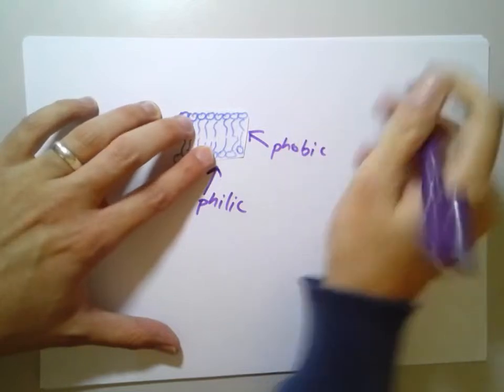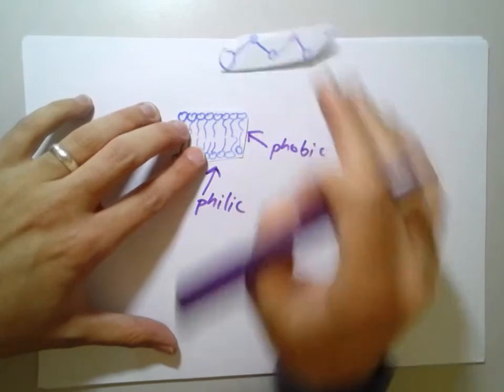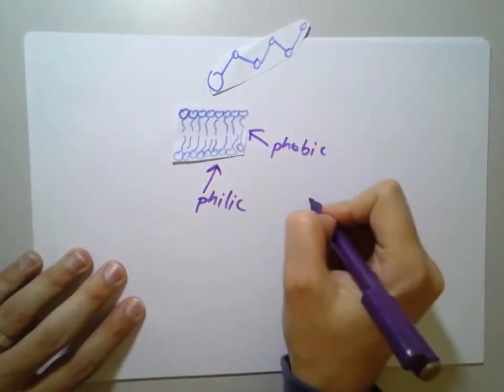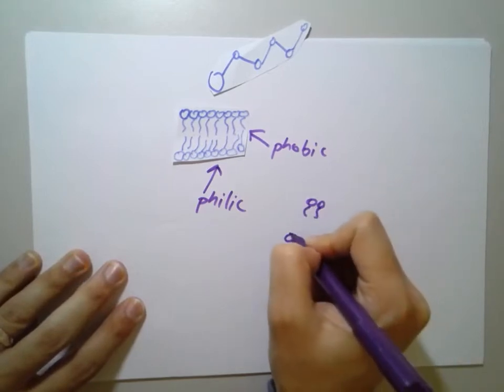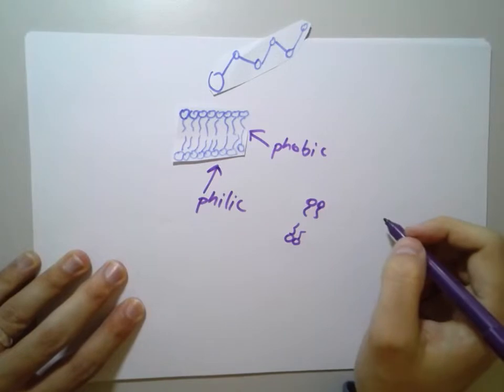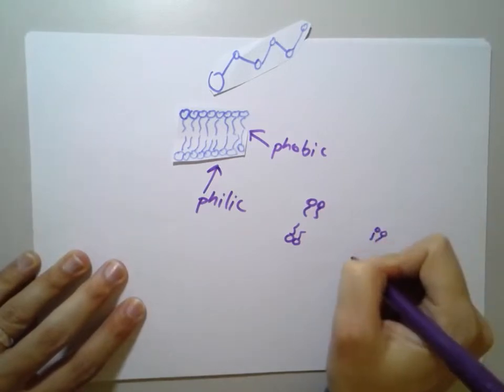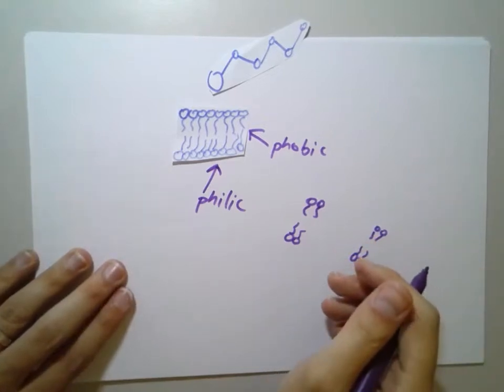Once they meet, the phospholipid bilayer, we'll get more into what that term means a little bit later, probably in the next few years of science, the heads break, hence exposing the organelles in the solution.